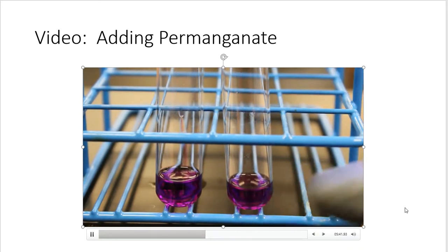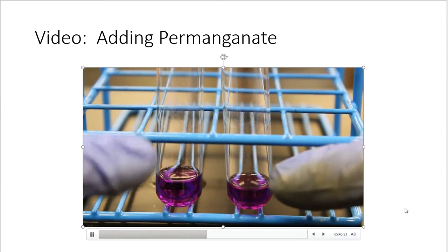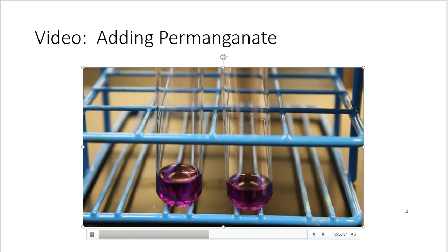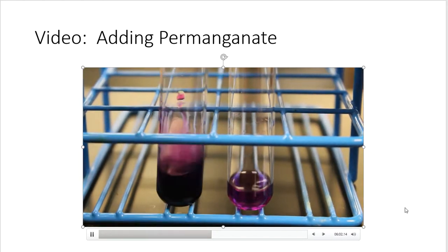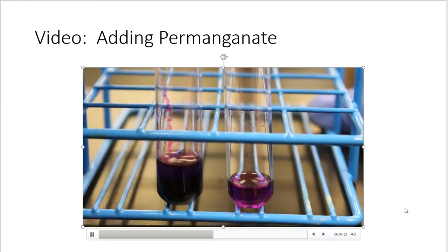Again, we know that acetone is not positive, and this is what toluene's already showing me, and that's at 2 drops. I can go on to 20. But it already turned purple within the first 2 drops. But again, to be consistent, there you go.